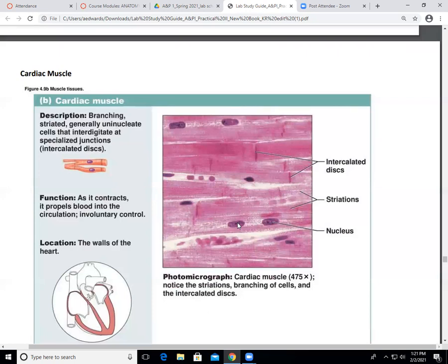Is it striated? Do you see those horizontal lines here? It's kind of harder to see than skeletal muscle for sure, but there are little faint lines in here, so it is striated. Also, a little extra information about cardiac muscle tissue is that it's branched, right? Because you remember skeletal was just straight lines going across. There are branches here, okay? It's not straight. Also, you have intercalated discs.